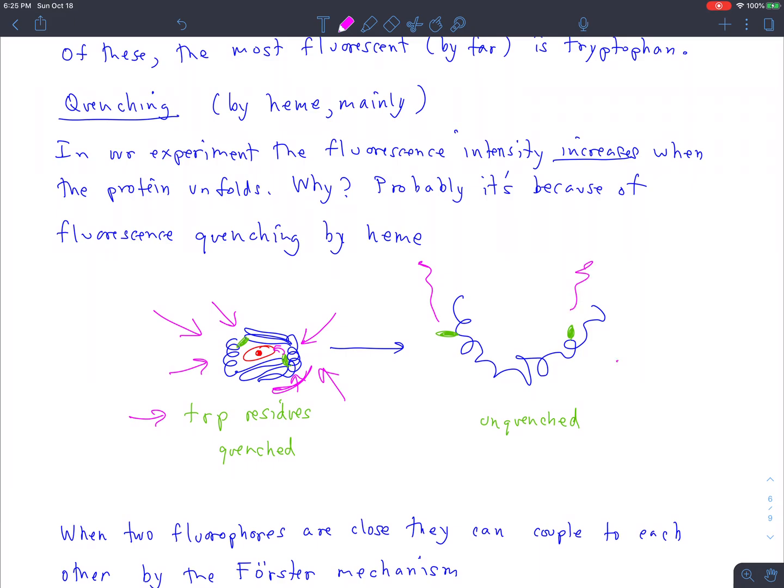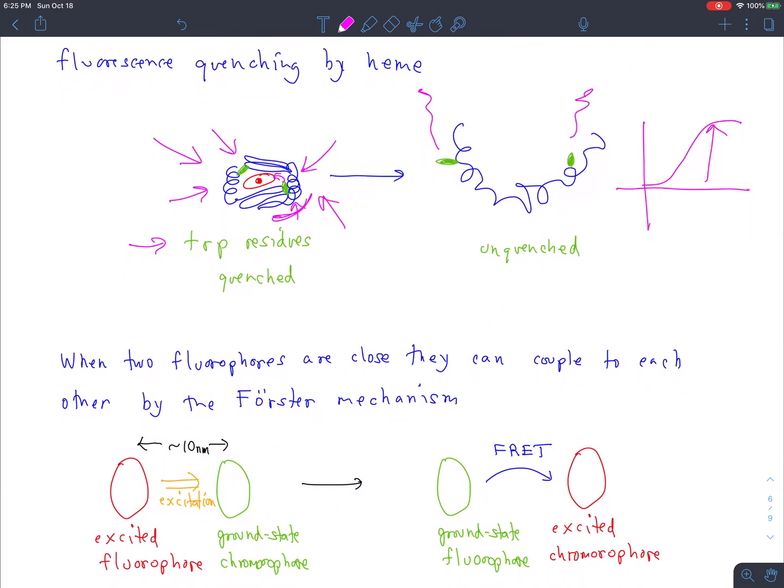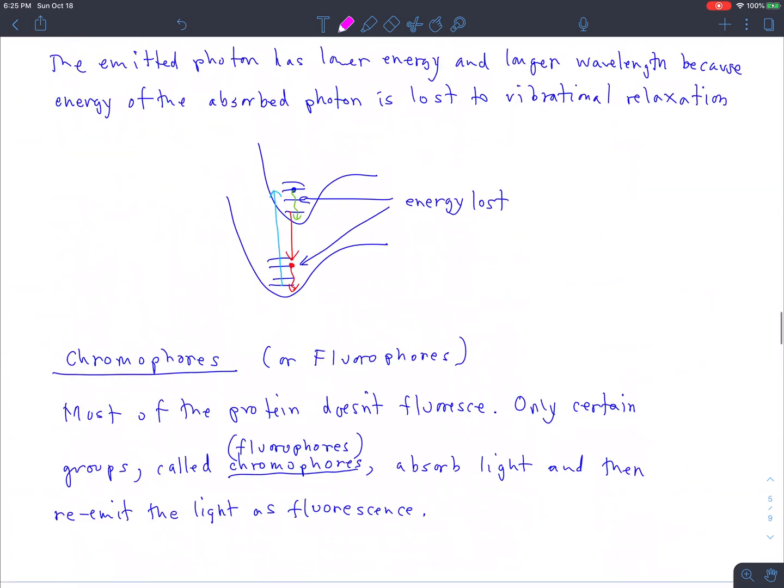And so what you see is as the protein unfolds, the fluorescence actually increases. So we're looking for an increase in fluorescence as we denature, as we increase the denaturant concentration.